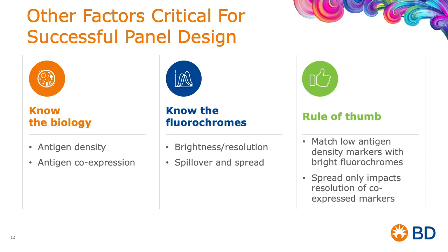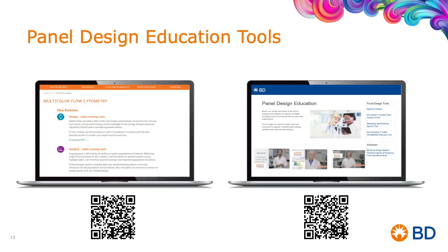Just last week, Bob Balderas gave a great comprehensive webinar on panel design that touched upon all these critical factors, and I would highly encourage you to access this webinar on demand on our website if you didn't have the chance to attend it live. We also have a number of other resources and tools on our website to educate you as needed on these critical factors for panel design. But I would really like to move forward now with the presentation and again speak about the impact of spillover and spread in the process of panel design.